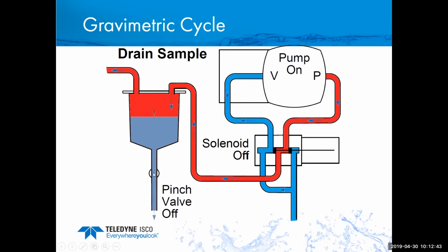And all the drain cycle is, it just opens up the pinch valve and lets all the water drain out into your bottle or bottles.